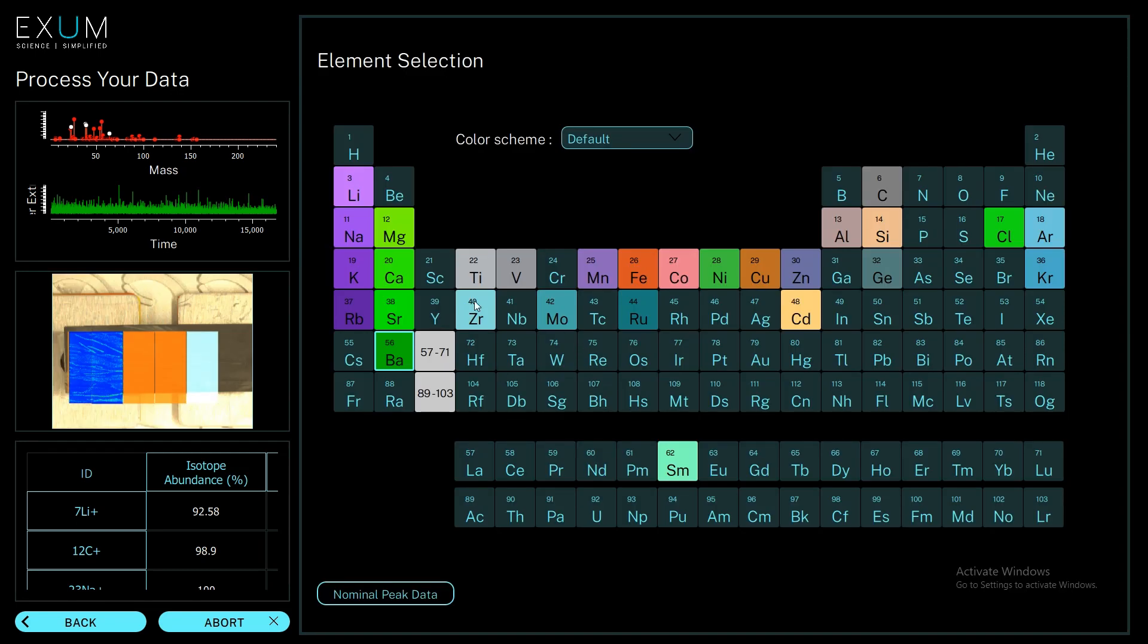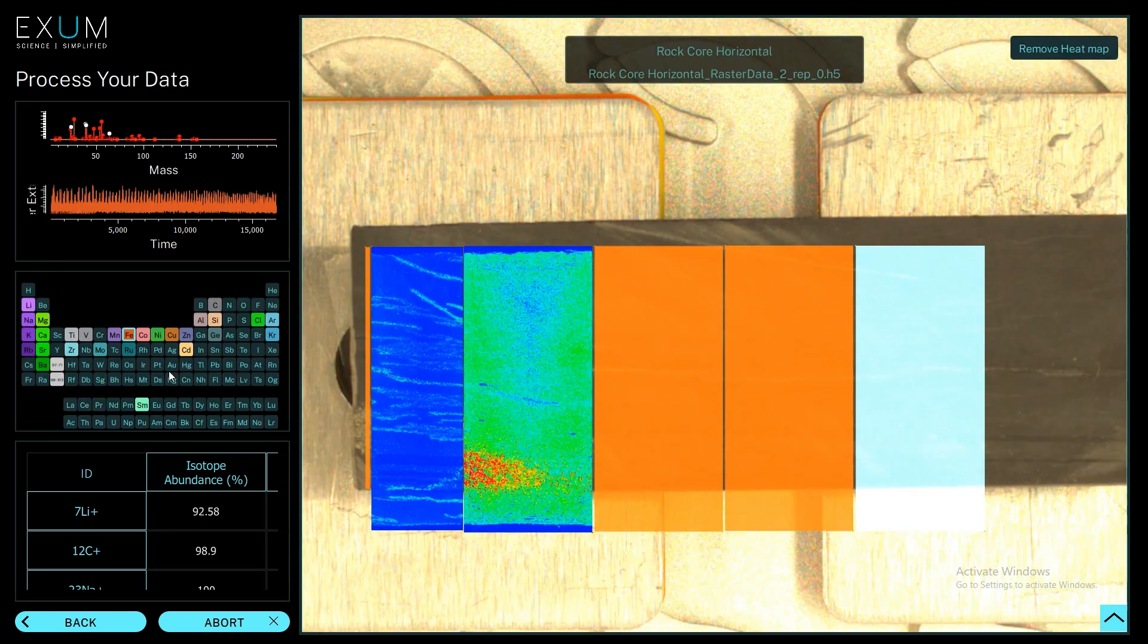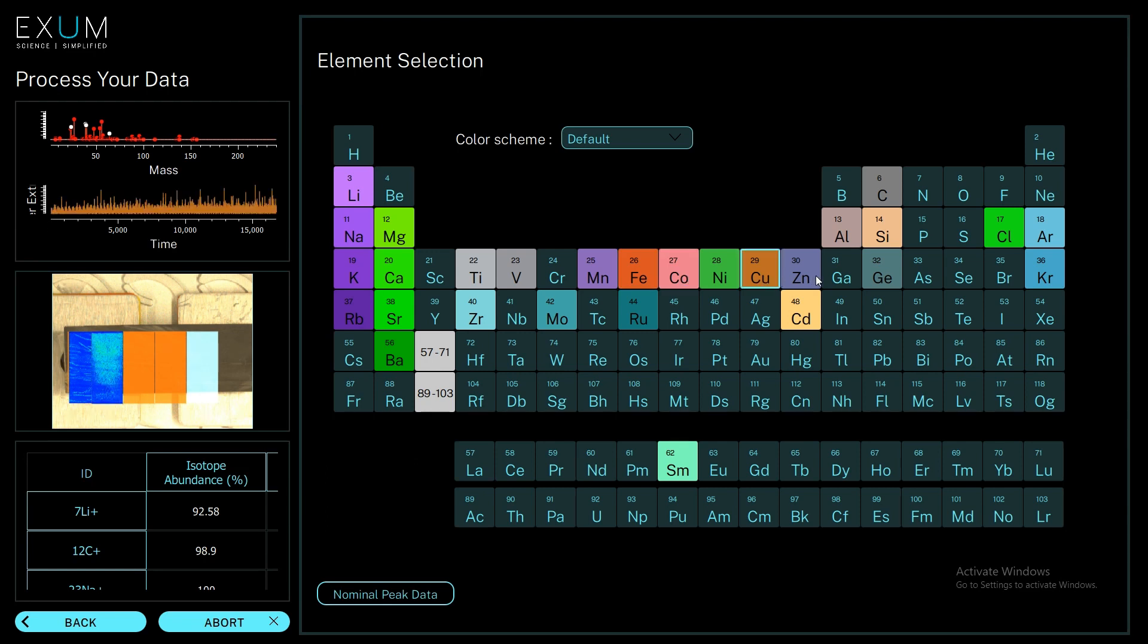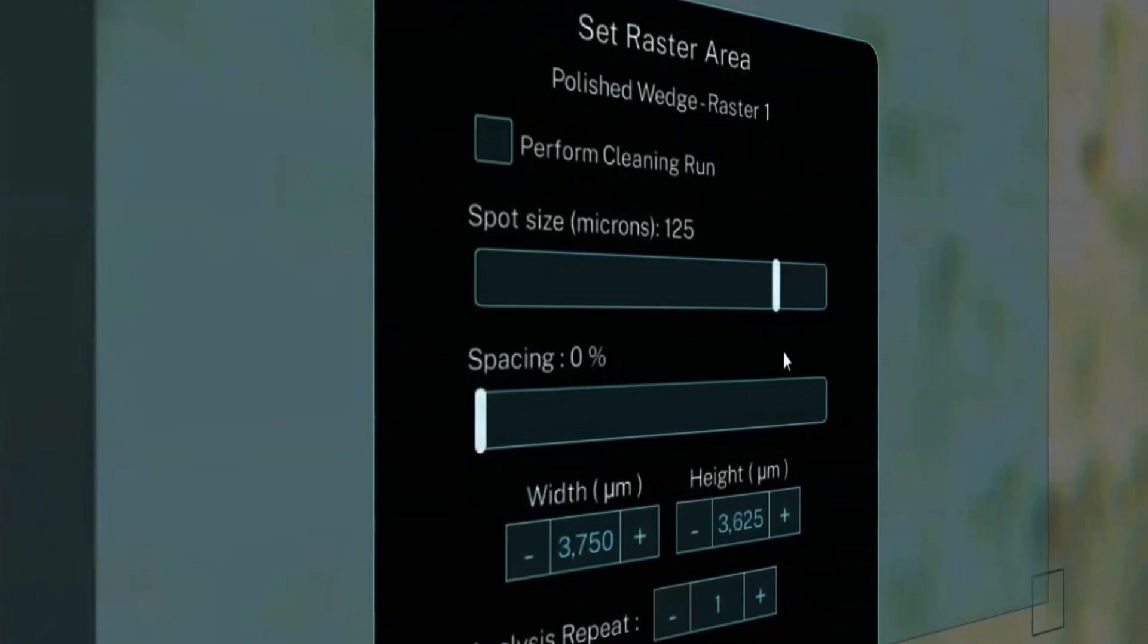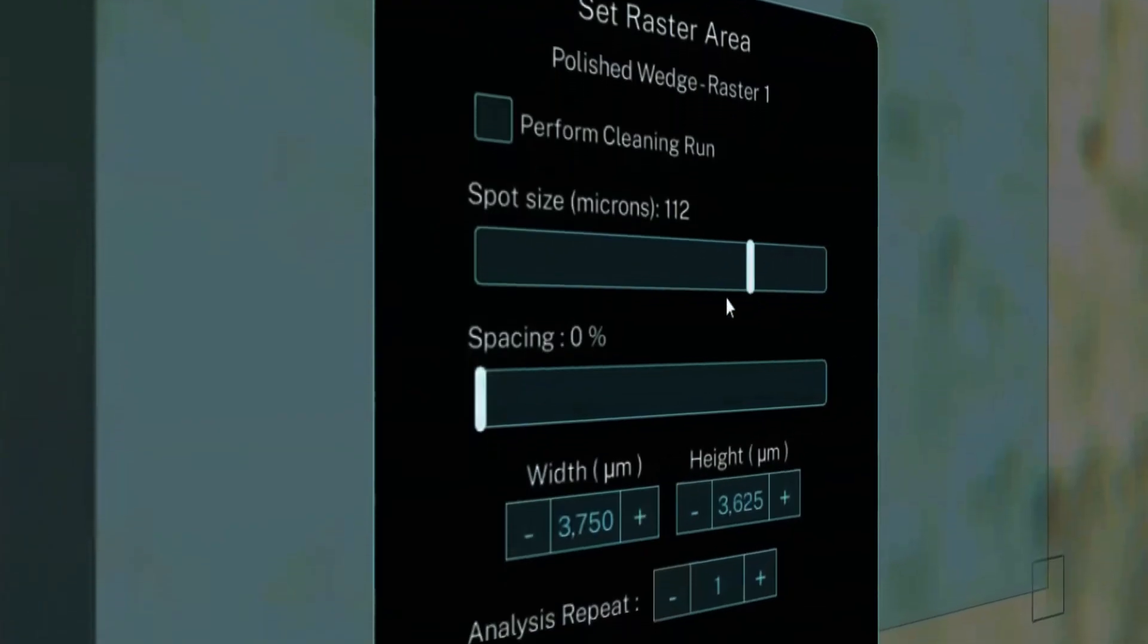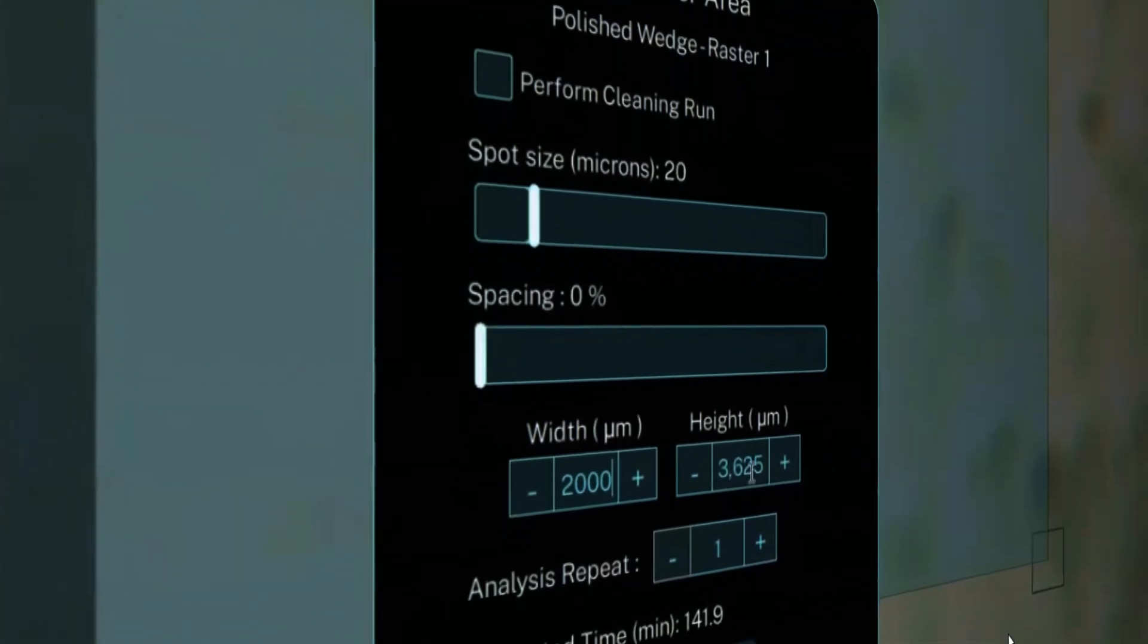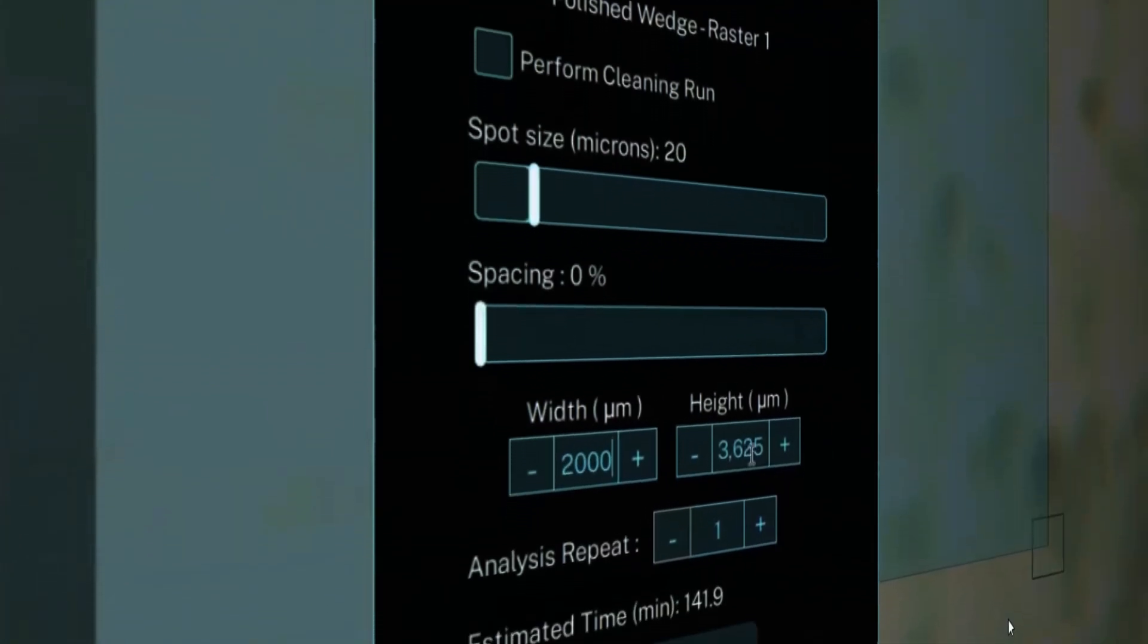Every spot that the laser ablates gives us the entire periodic table again, that lithium to uranium. We can turn on each of these individual channels and look at what the different elements are doing and where they are. We can do this on a three inch by three inch area with a resolution of one to 175 microns.